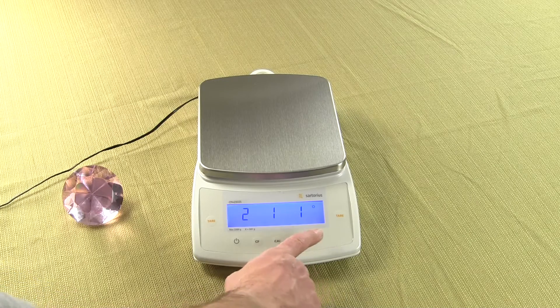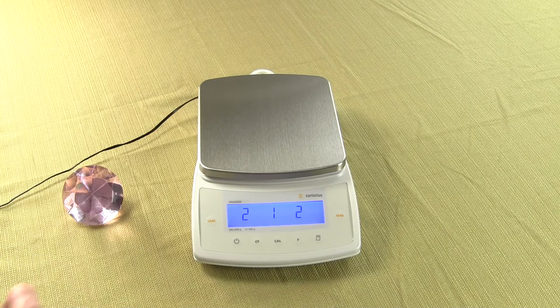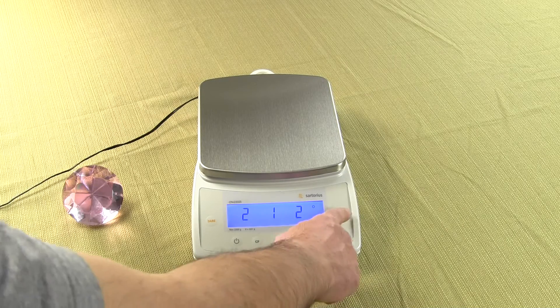We have a 1. Press the Print key again. We need 2, 1, 2 — press the Cal key. We have 2, 1, 2. We now need to get that 0 in the upper right-hand corner. Press the tare key. When you press the tare key, it stores it. So now we're ready to reset the balance.